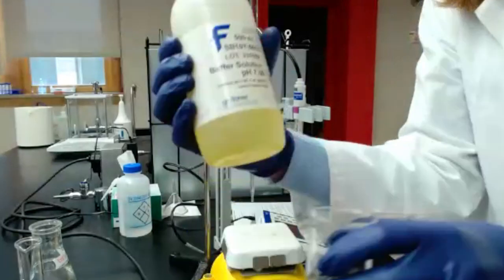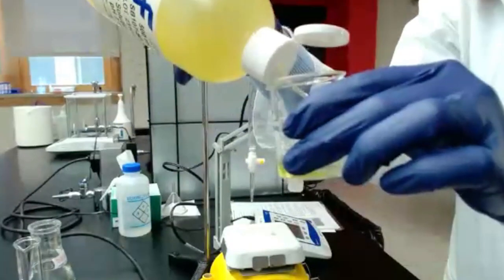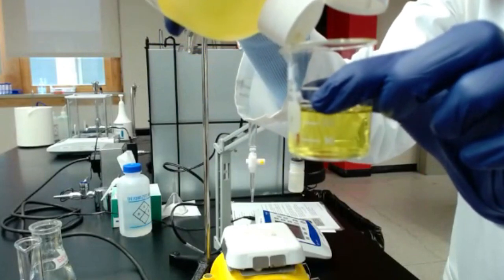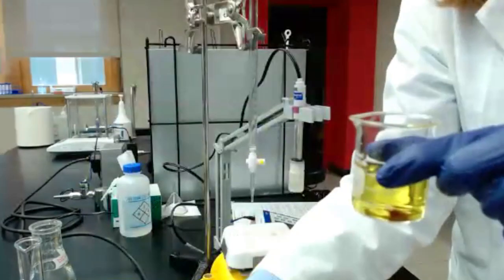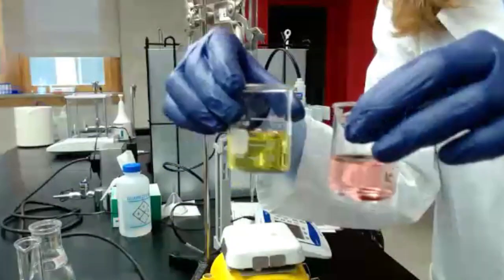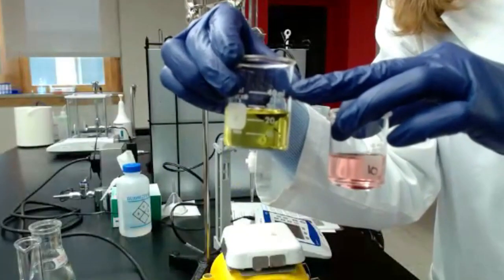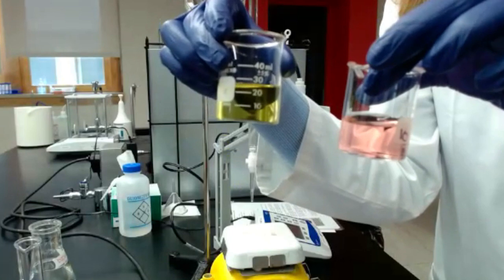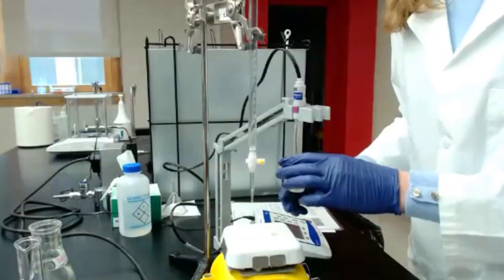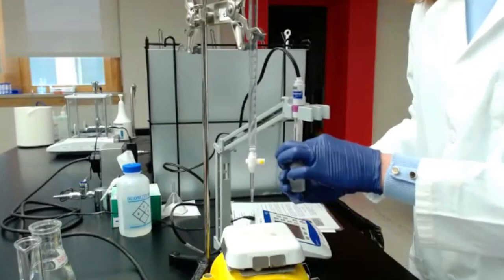The good thing about the buffer solutions is that they have different colors. You can see the pH 7 is yellow and the pH 4 is pink. If you forget to label your beaker, you will still be able to see the difference, so you will know which solution you're going to use.